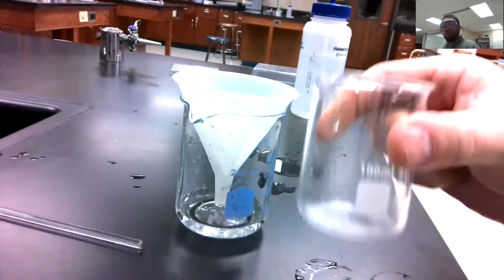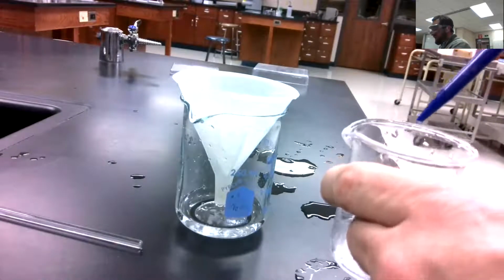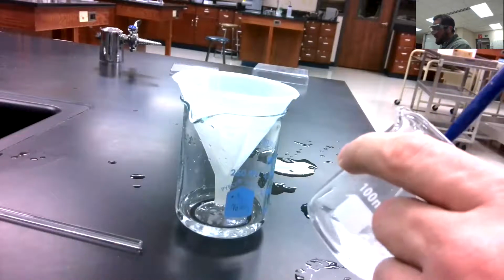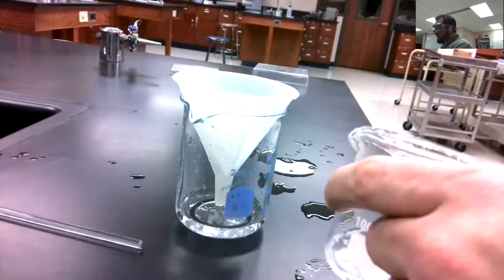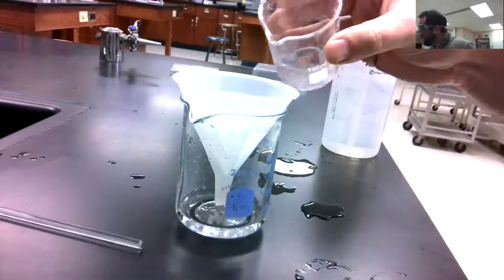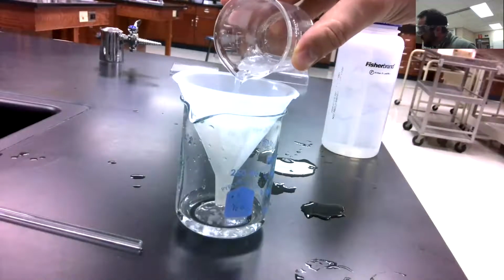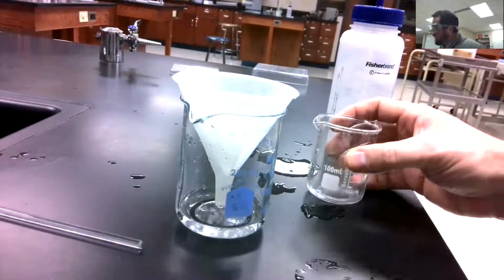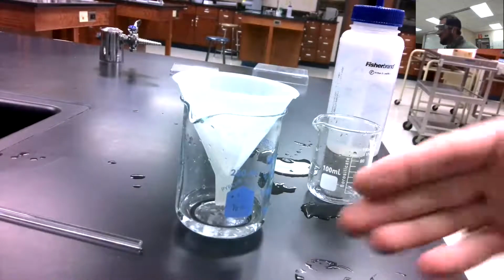So in order to get it out, I'm gonna add some distilled water, kind of make sure I get the sides of the beaker. I want to get all of that white stuff. Get a rinse here. And guess what? I need to pour this through the filter paper. Nice and slow. Again, don't want to go up and over. I've done a really good job so far. You guys can notice, we've still got clear water there, so it doesn't appear as though we've lost any product.